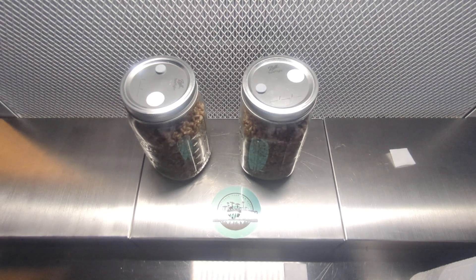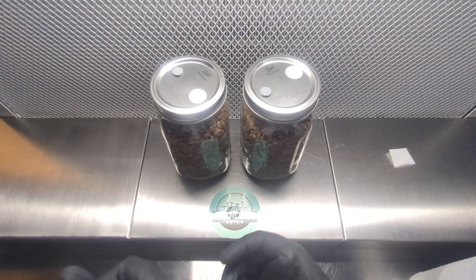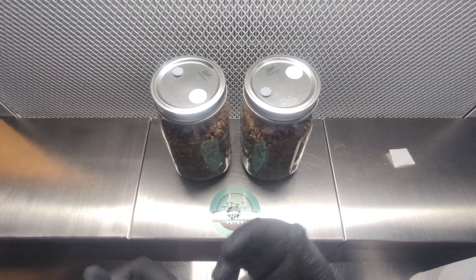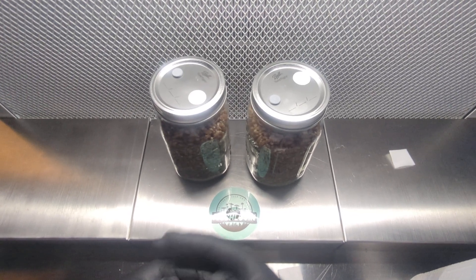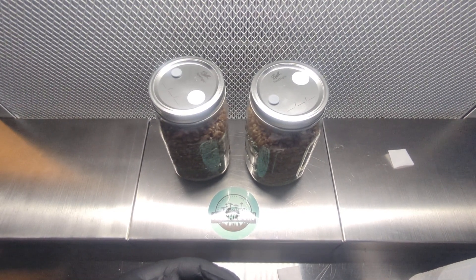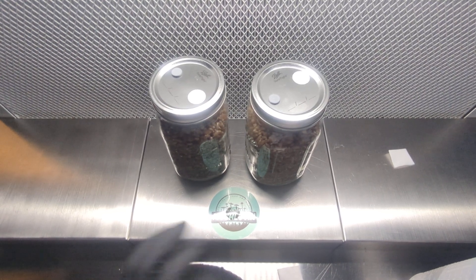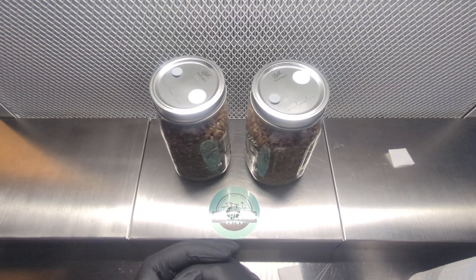I'm going to take these jars and put them in our incubation area. I'll try to keep it at about 78 degrees Fahrenheit consistently. They don't need any airflow at this point — the filter patch will allow for gas exchange, which helps the mycelium exchange oxygen and carbon dioxide. I should probably see a little bit of growth in about three days or so. Once it starts, it takes off, so in about a week I'll probably be able to do a break and shake. After the break and shake, it'll probably come back within a few days and be ready to use.